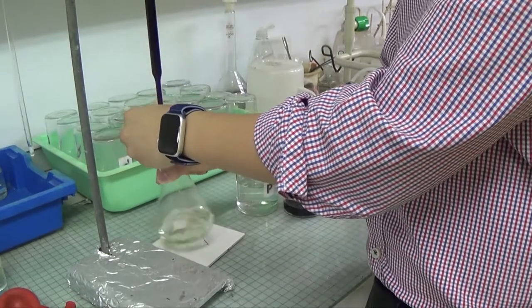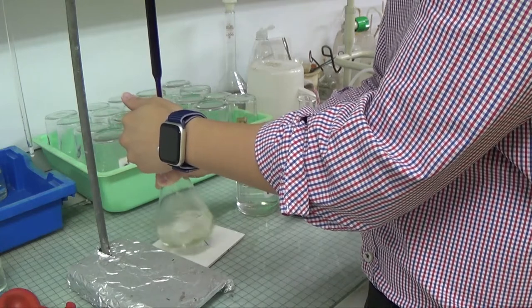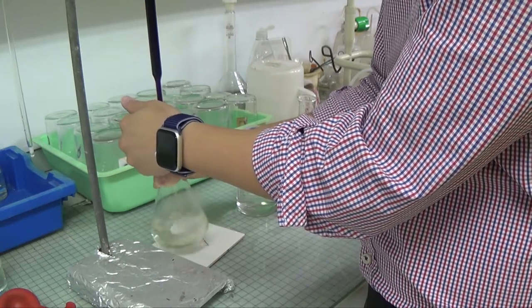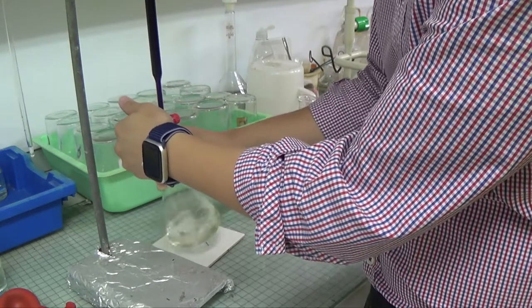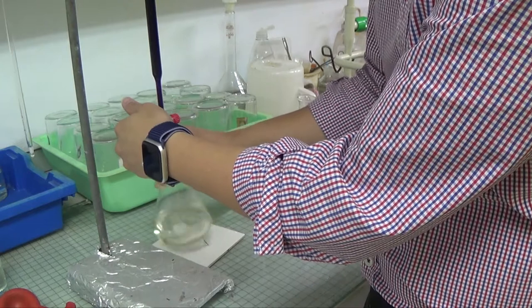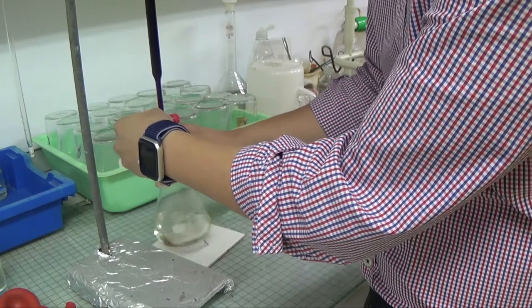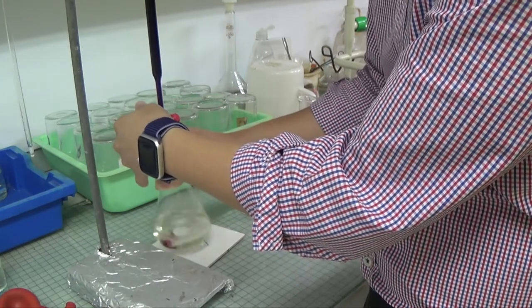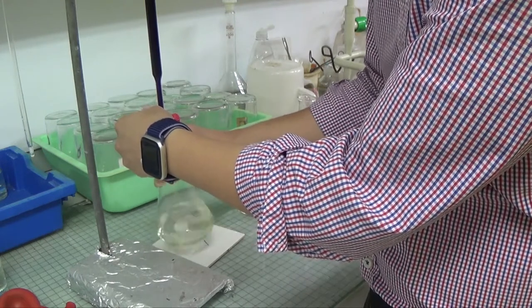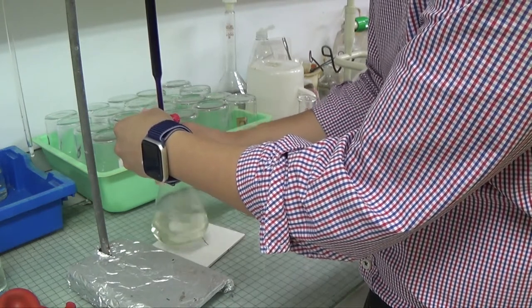Okay, so your hand on the burette valve, and then one hand continuously swirling it, and your eye is not on the burette reading, because there's no point of reading from the burette right now. We have already taken into account how much it would be if it is in excess, so we will just monitor what happens to the reaction as it goes drop by drop. I might have been a little bit conservative in stopping too early, so this might take a while. If you want, you can probably fast forward this video, but I don't want to risk having to redo my accurate titration again.